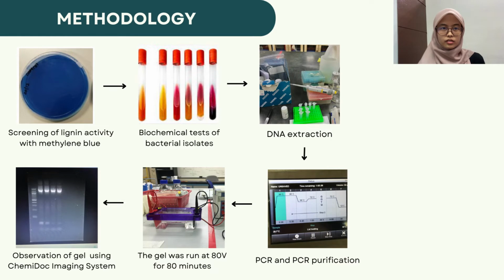Biochemical tests such as gram staining, catalase, motility, sulfide and indole test, and also MRVP were done. Molecular methods such as DNA extraction, PCR and purification were performed to determine the species and genus of the organisms. And gel electrophoresis was run and visualized.